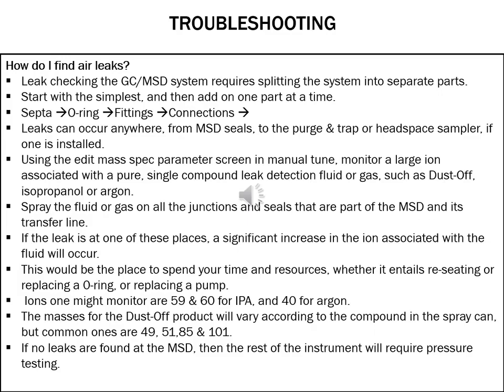For instance, if you've got a leak, how to check the leak on the MSD, and you might have to separate the parts. I always say, for instance, if you've got an air leak on an instrument, it's not always a good thing to start on the MS. Always start from your sample introduction. For instance, you might find that the septum is weak, so you'll have to replace that septum, put in a new septum, and then check the air leak again.